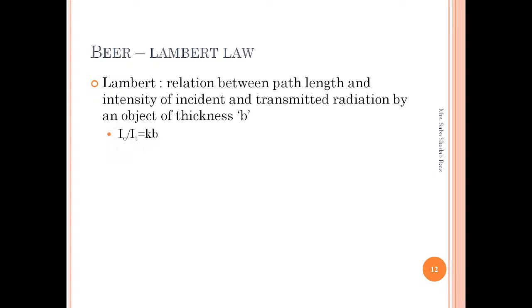Basically Lambert studied how the thickness affects the intensity. It is given by I0 divided by IT, which is the absorbance, and it equals KB, where K is a constant and B is the thickness of the object.